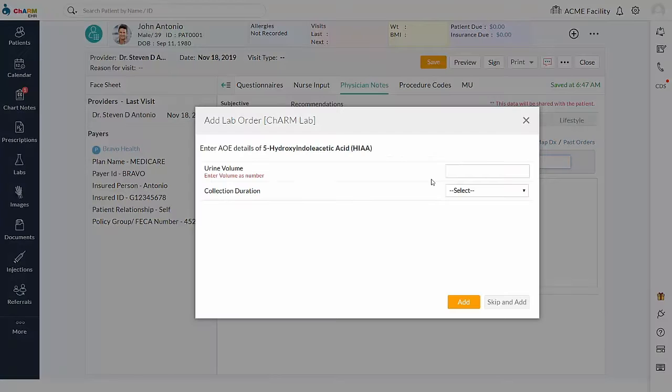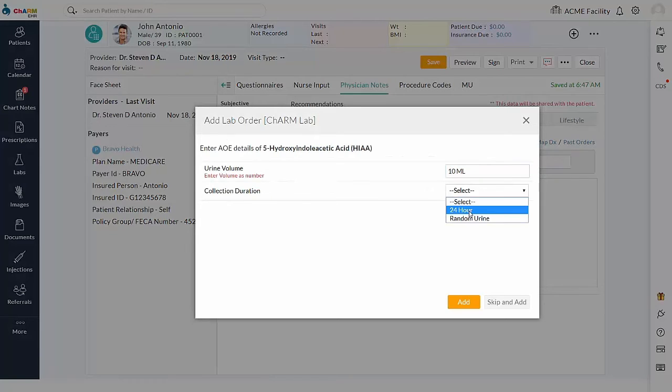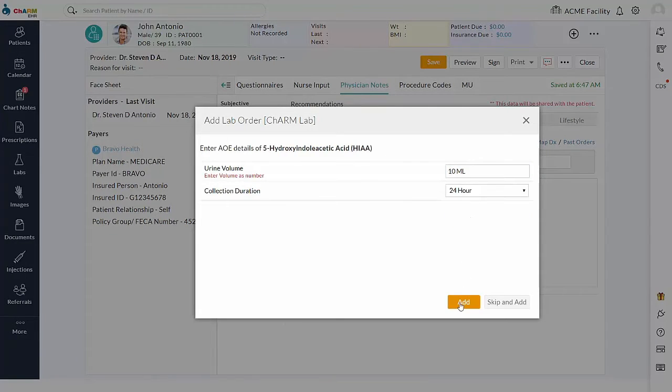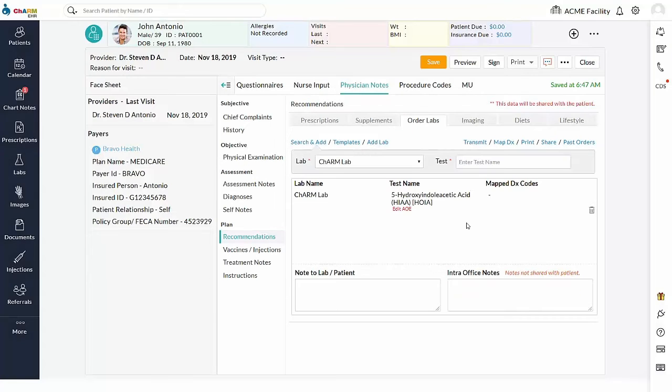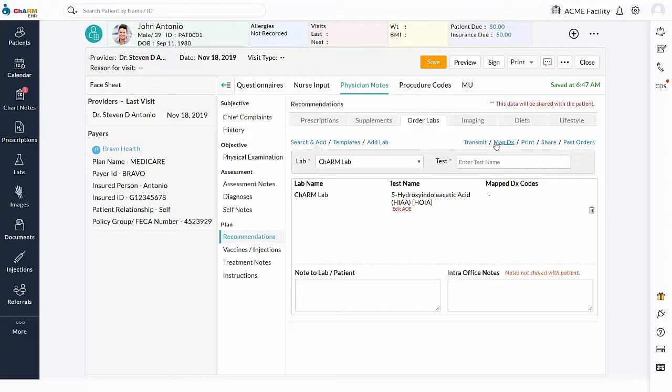If selected test has Ask at Order Entry or AOE questions, questions will pop up. Fill in the answers and add the test to the chart note. Edit AOE option can also be used to edit the filled in AOE details. Multiple tests can be searched and added to the lab order.